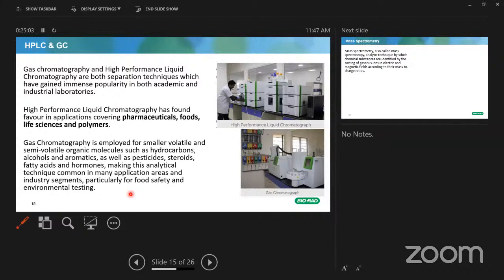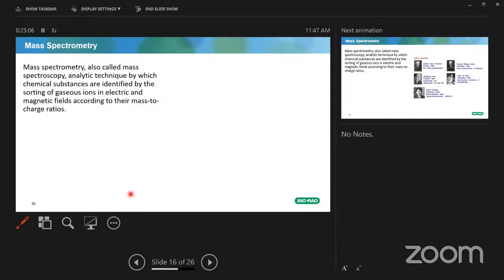So we talked about all the liquid chromatography. Now we'll jump into the mass spectrometer, or mass spectroscopy, and its history. Mass spectrometry is also an analytical technique. It's basically ionizing your compound of interest and measuring the mass to charge ratio. This is a very important tool, especially for high sensitivity, understanding what the different fragments within the compound are, how it has been broken, what the abundance of each fragment is, those sorts of things.